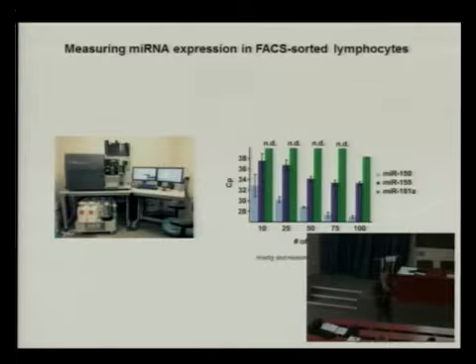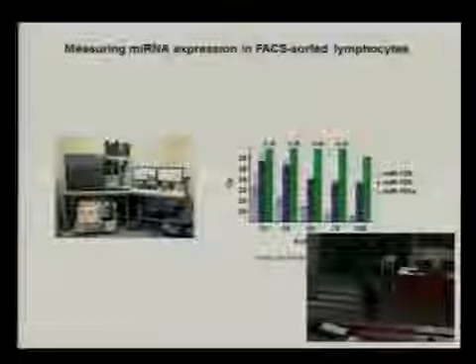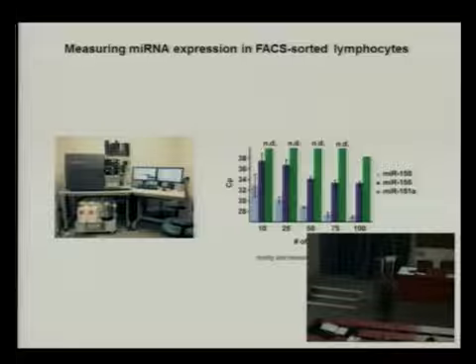You shoot the cells into the 96-well plate, you cook them, and you perform first-strand synthesis and measure the qPCRs. It's really easy to do, and it's also easy to detect highly abundant microRNAs, which is shown here. Medium abundant ones are also kind of easy to detect, and for low abundance, you probably need about 100 cells.